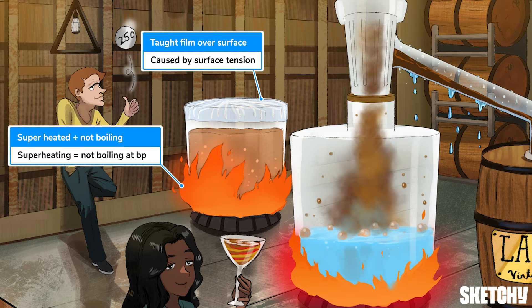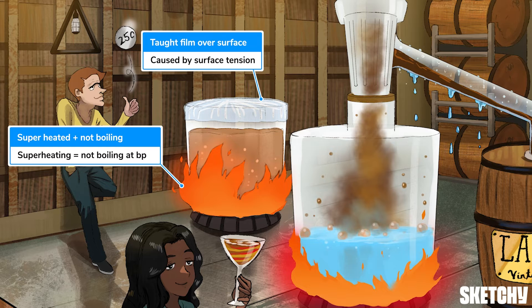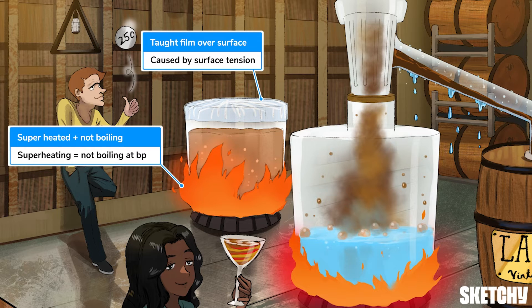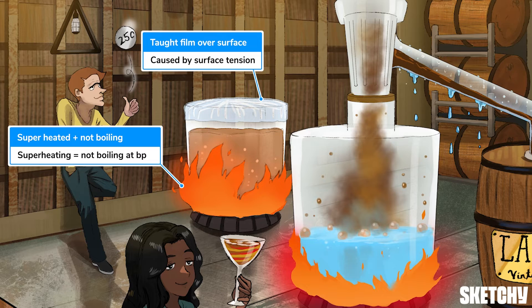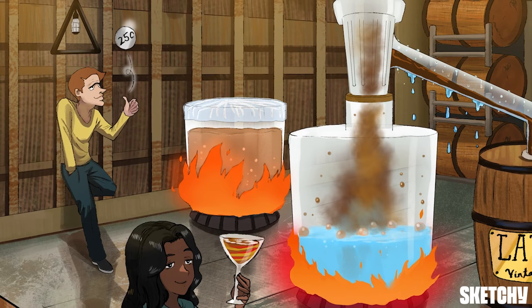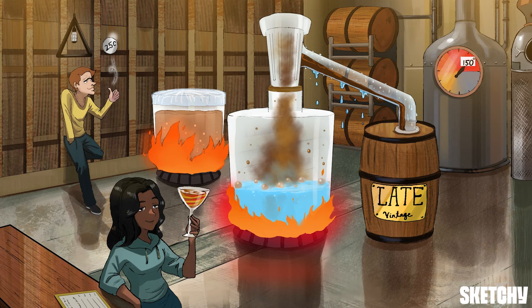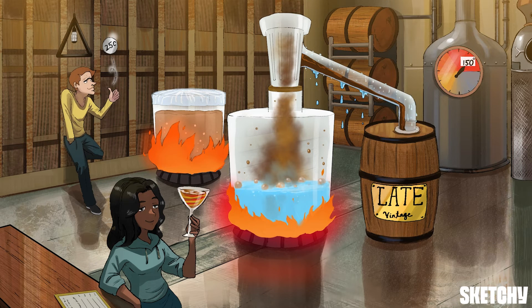Needless to say, all of this is bad news for distillation. So chemists often use automatic stirrers or little beads called boiling chips to help reduce surface tension and prevent superheating. Now that we've covered the basics, let's move on to vacuum distillation and fractional distillation.